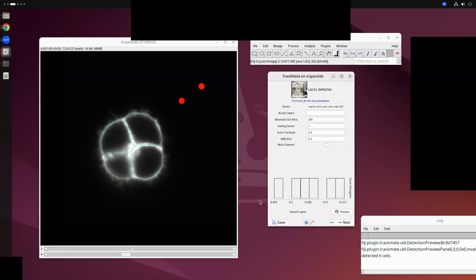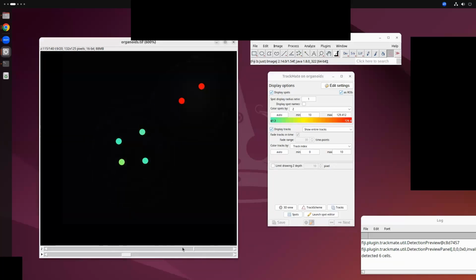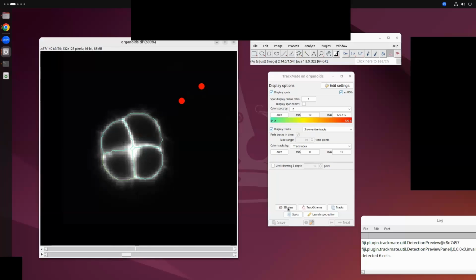So at this window, there's this setup icon, this switches to the setup system, and you can change that. It's one thing I would typically want to do, to make things much easier to see. Now you can scroll through the Z slices and see the segmentation correctly.